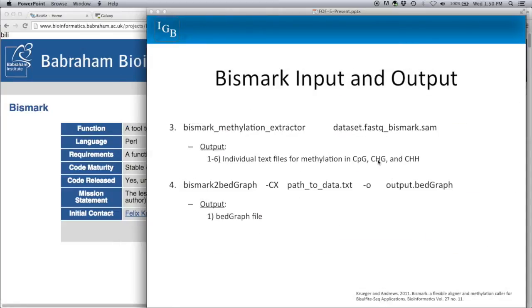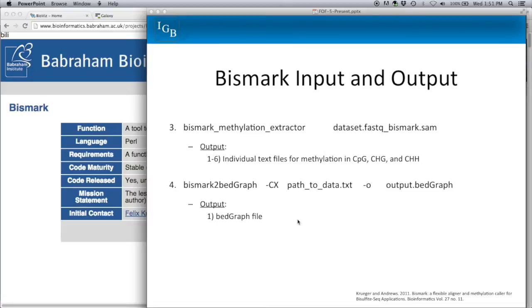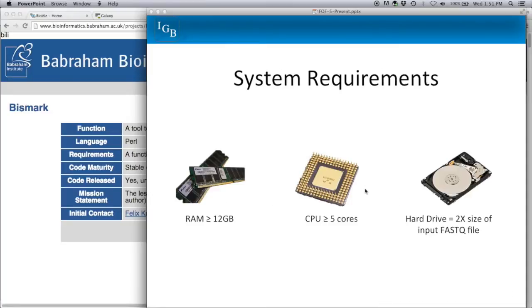The third step is to run the methylation extractor — the input is your BAM or SAM file, and the output is six individual text files: one each for CpG, CHG, and CHH on both the top and bottom strands. These text files are in a proprietary format so we can't view them directly in IGB. The fourth step is Bismarck to bedgraph, which converts those text files into bedgraph files — and that's what we can visualize directly in IGB.